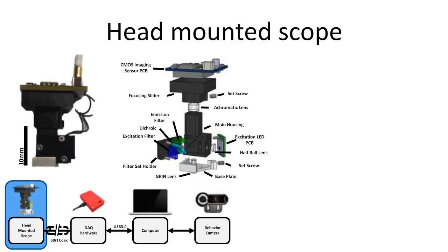It's a very simple design. Everything is held in place by a set screw, and this surprisingly simple design leads to very stable imaging over many days to weeks.